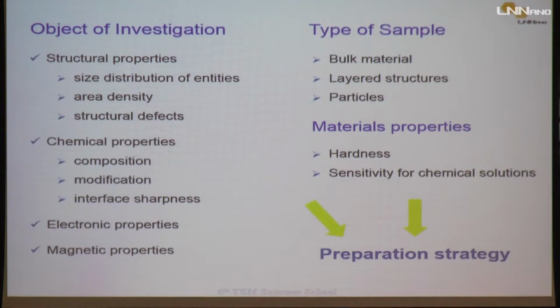For each one of these requirements, it's more adequate to find a specific strategy for the sample preparation, okay?